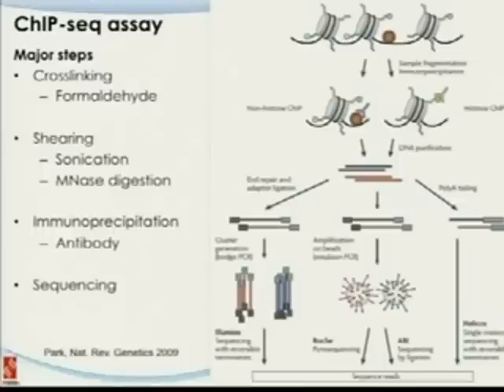We will talk about that next time. There are some special technologies to look into that, because one of the things that people are taking advantage of is the directionality of sequence reads. And that will help us to narrow it down. We'll talk about that next time. And you won't get one base pair resolution level, so you wouldn't know the exact location of those DNA binding locations. At that time, which we'll also talk about next time, you will have to go through some additional bioinformatics analysis to do the motif finding in those regions. But certainly, your resolution is much better than a few hundred base pair, and maybe you get down to 30, 40 base pair. So there are special algorithms that are designed for that. And we'll get through this shearing part in the later slides.